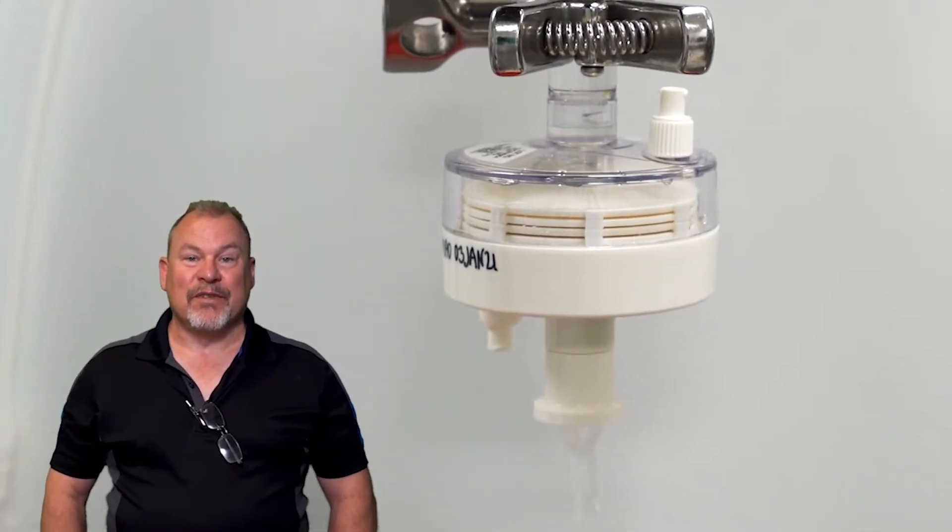Hi, my name is Ron Tresker. I am the Associate Director of Engineering at BSM. I have worked at BSM for three years now. Water here is used for a lot of activities that we perform in and around the clean rooms, and there is a lot of work that goes into making this water.